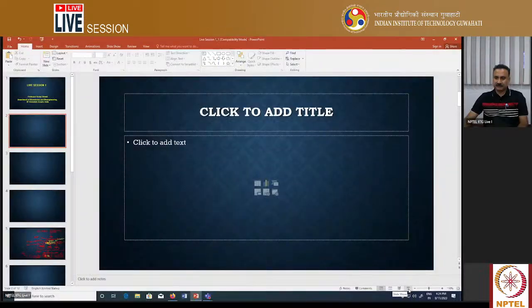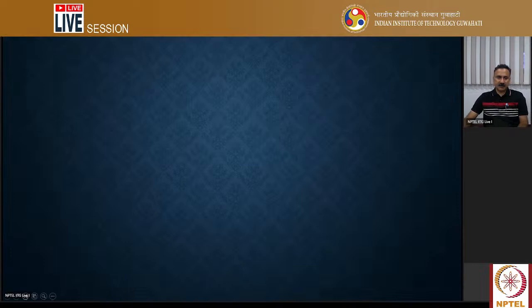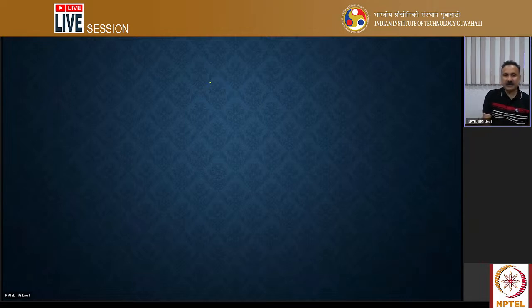So Shrutika is asking about what is the difference between the urea page and the native page. So let me share my screen and I'll be able to explain. Do you see a screen now, right? Okay. So the differences are very clear.